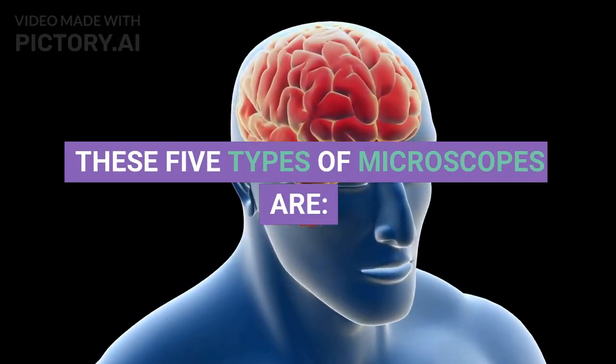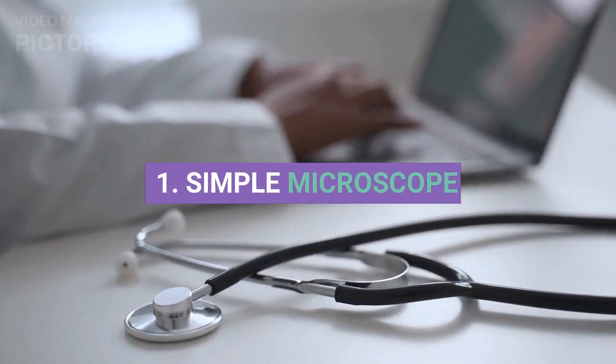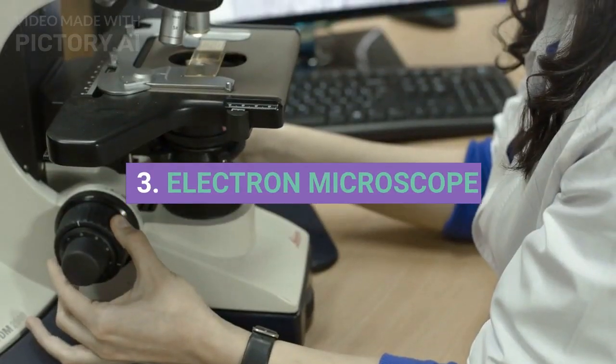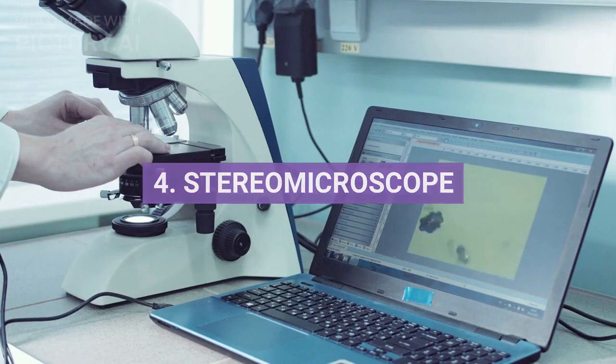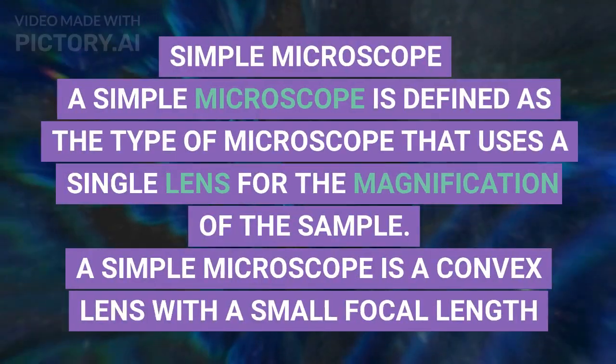These 5 types of microscopes are 1. Simple microscope. 2. Compound microscope. 3. Electron microscope. 4. Stereo microscope. 5. Scanning probe microscope.